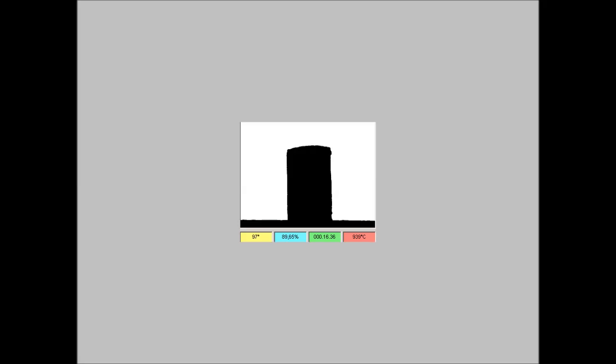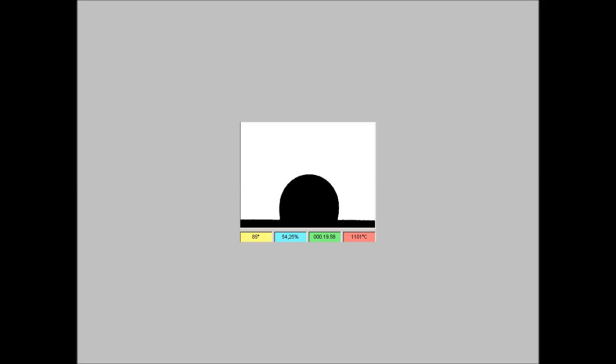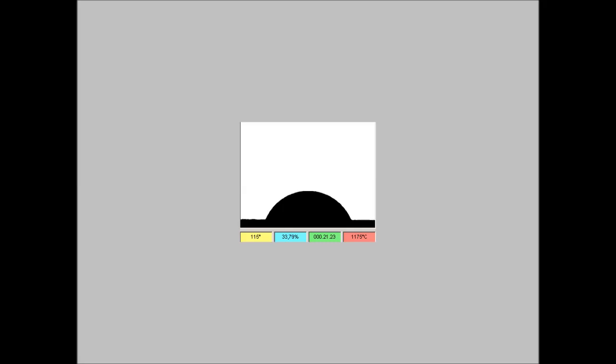In the initial part of the test the material undergoes a simple thermal expansion. Then the sintering process starts and the shape is maintained while the dimension is getting smaller. At a certain temperature the liquid phase emerges on the surface provoking the softening of the sample. From this point on the surface tension is taking control of the shape which is continuously changing to sphere, half sphere and finally complete flattening.